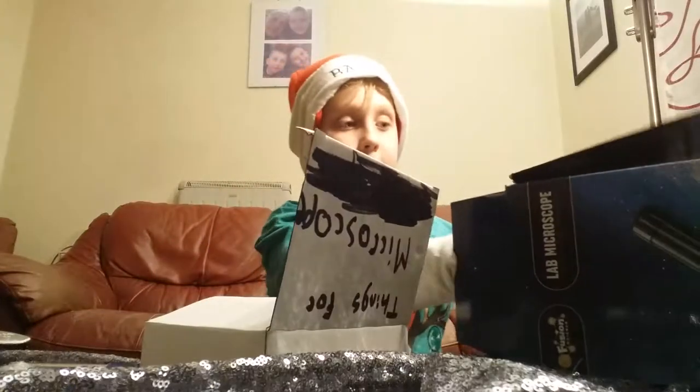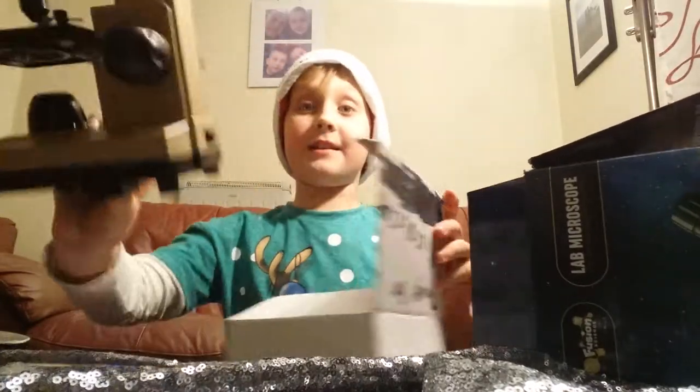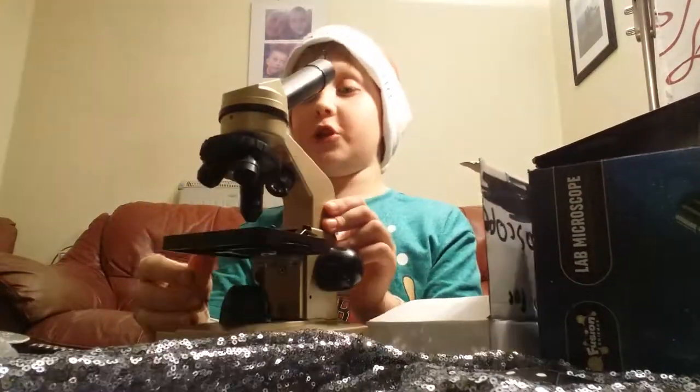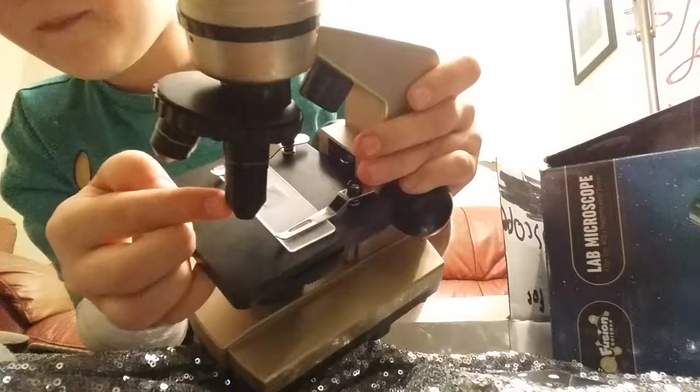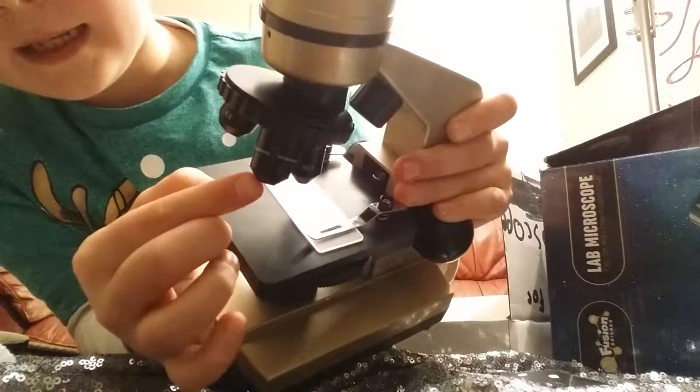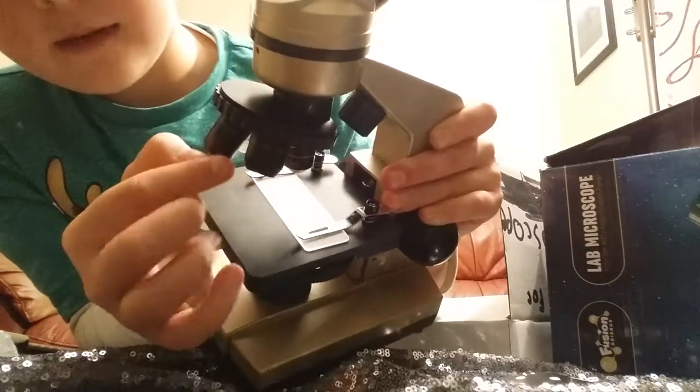Basically, I'm just going to now take out the microscope. Now this is the microscope. It is huge. As you can see, there's the biggest one here which is zooming 40. This one is zooming 10, and the smallest one is zooming 4.